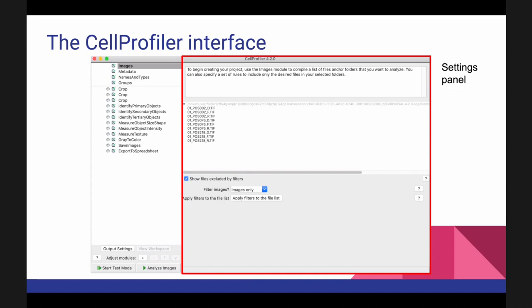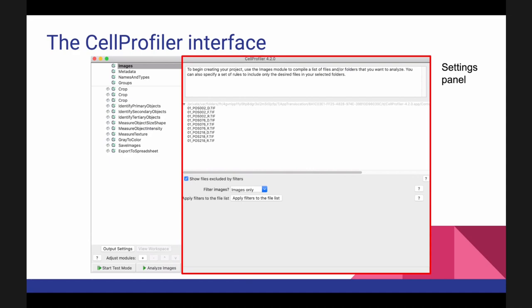Each module — and we're up to about 90 — has a settings panel where you can configure settings for your images. The most important button in CellProfiler is the help button. With something like 950 settings across 90 modules, that's a tremendous amount to remember. Every module and every setting has a question mark button explaining what it does and giving tips for configuration, even if you're not an expert in computer science.